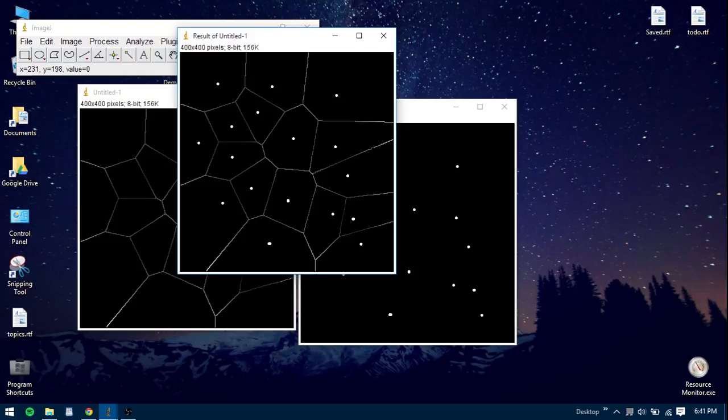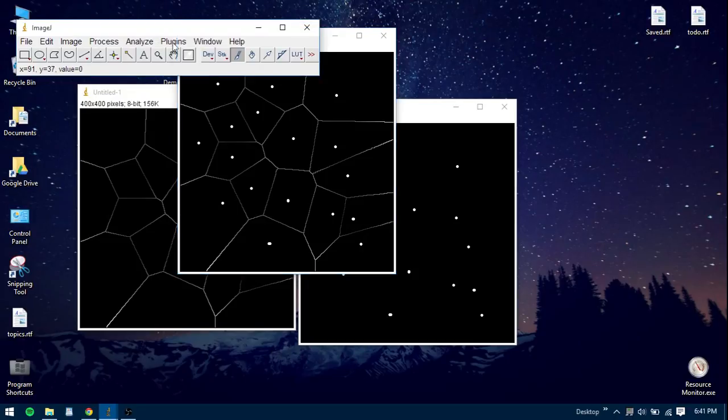And I think that about wraps up what I wanted to discuss in this video. And the only other thing I can say is you just got to play around with all the different features in ImageJ before you really get a feel of it. There are a couple of other things that I haven't really gotten very much experience with. That would be putting in plugins. You usually just download them from online. And another thing would be writing your own scripts, macros that you automate.